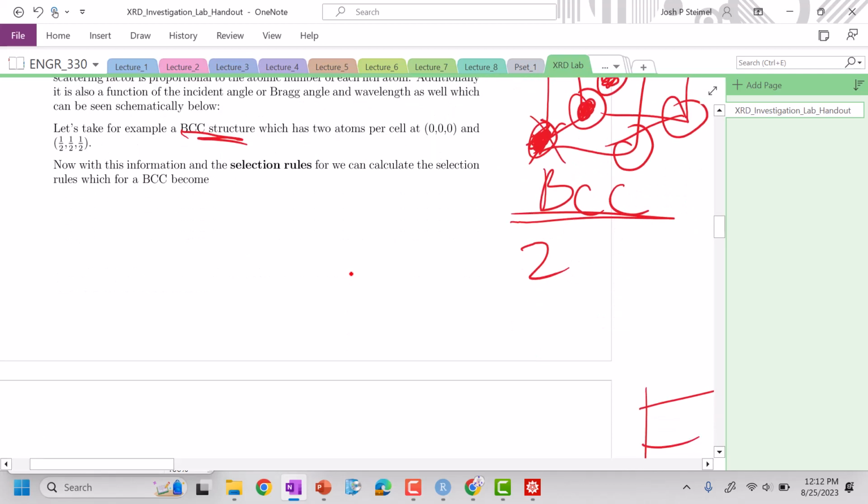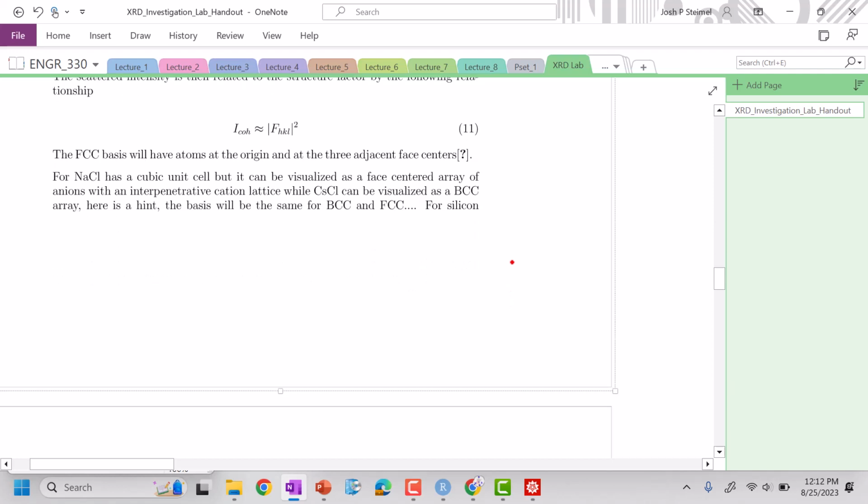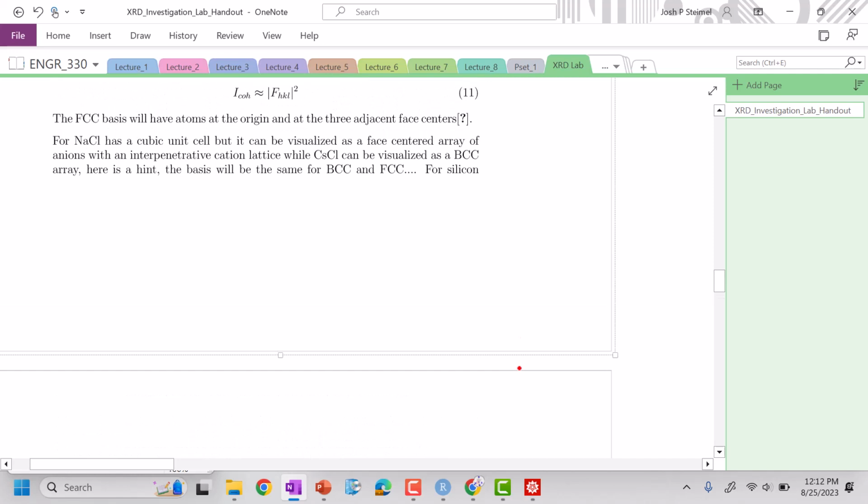So BCC, aren't I so nice? I mean, it's in the lab handout. I'm doing it on the video. I'm just joking. Not really, but it's true. But anyways, we can go a little bit further here.